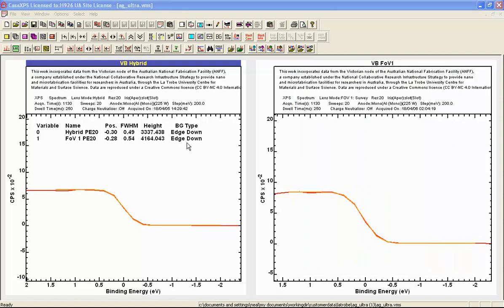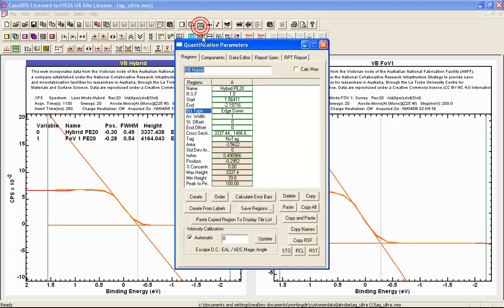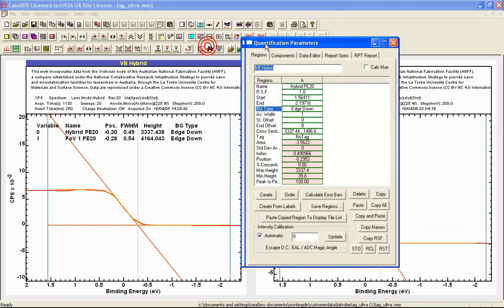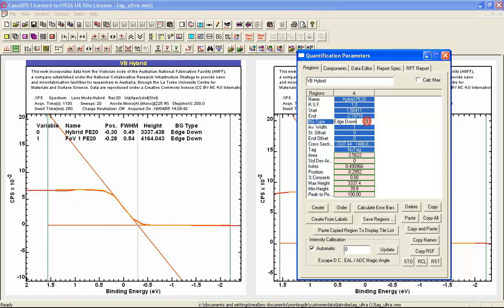When the edge down background type is used, the position is determined by a line through the point of inflection with the gradient of the point of inflection and where it intersects with a horizontal line. The complementary error function is calculated as the integral of a Gaussian. So the point of inflection represents the maximum of the Gaussian. This means that the position for the Gaussian is different from the position that's reported by this technique of intersection of two lines. If we wish to use the point of inflection or the maximum of the Gaussian, then there is an alternative to using the edge down background type. And this is the step down background type.